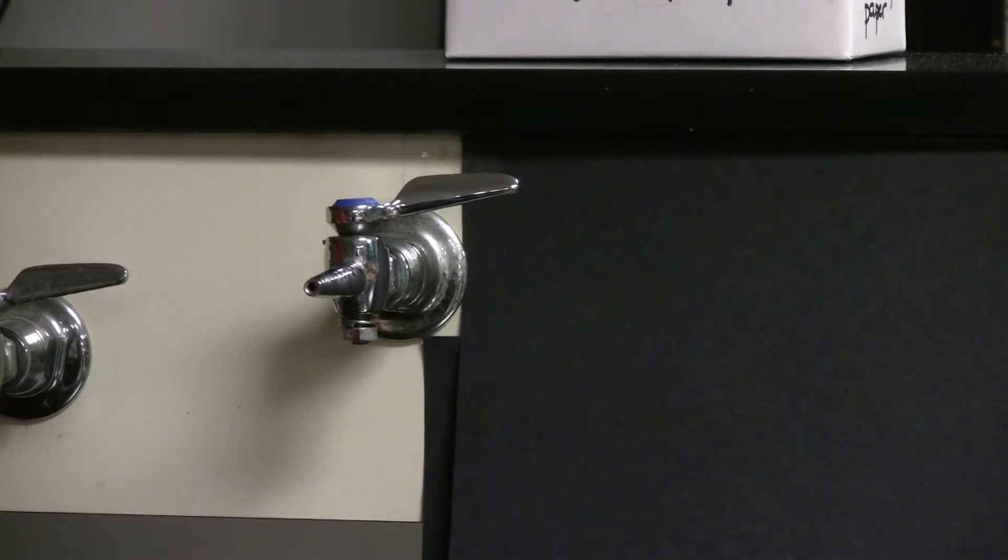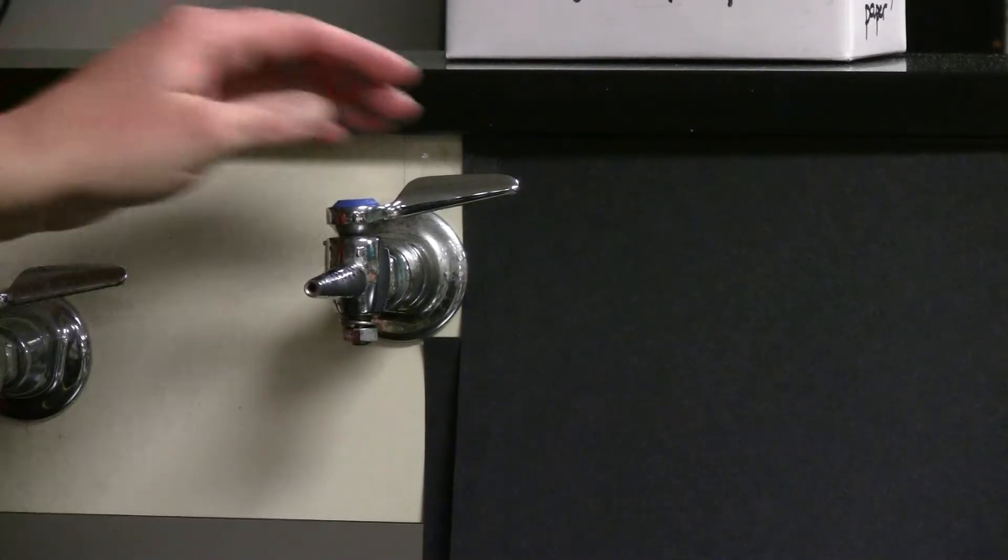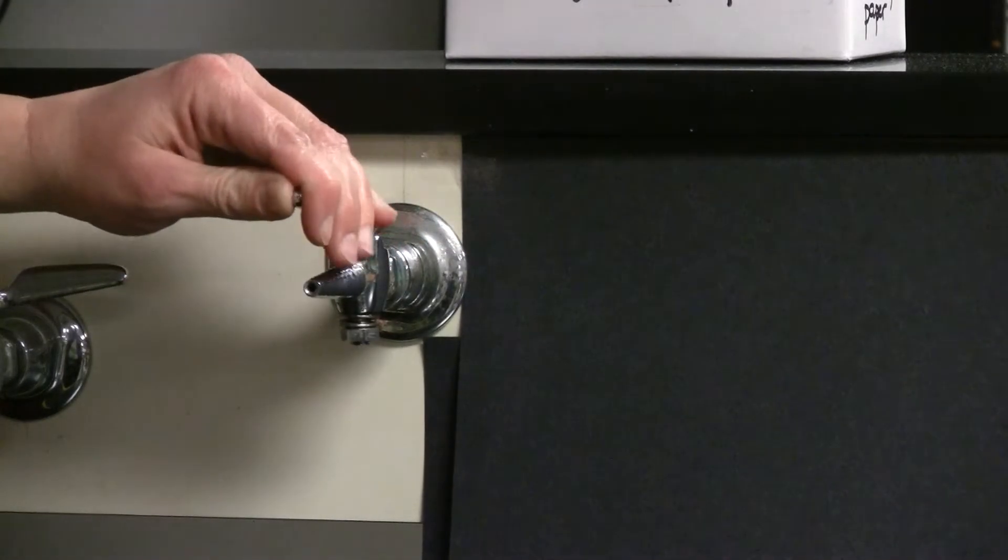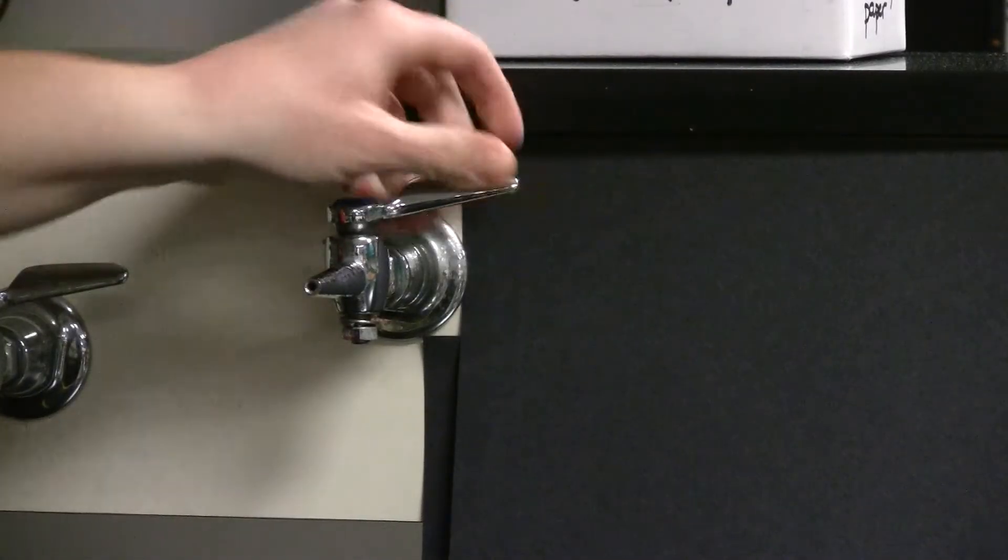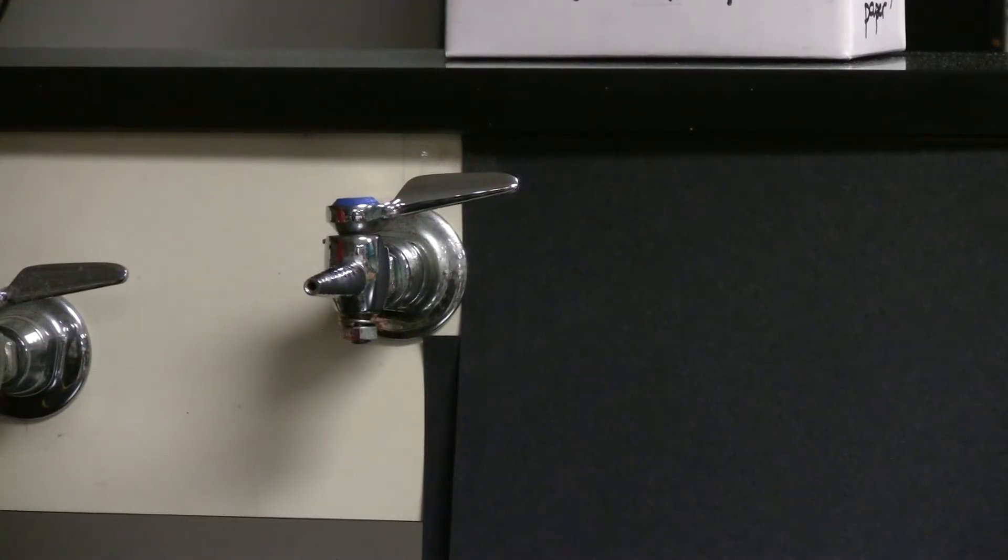To open the gas valve, you would turn the handle so that the handle is parallel to the nozzle. Always make sure that it's open all the way, that it is completely parallel or in line with the nozzle. It should not be open part of the way. To turn off the gas, return the handle back to perpendicular in either direction.